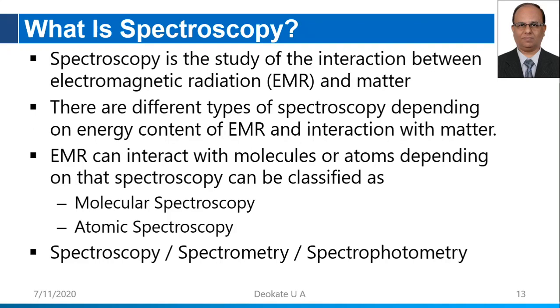Another term which we commonly use is spectrophotometry, a method to measure how much light a chemical substance absorbs by measuring the intensity of the light beam which is transmitted through the sample. The basic principle is that each compound absorbs or transmits light over a certain range of wavelength. This measurement can also be used to measure the amount of known chemical substances.